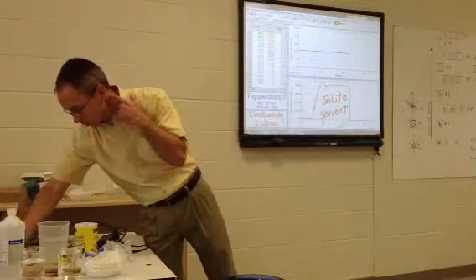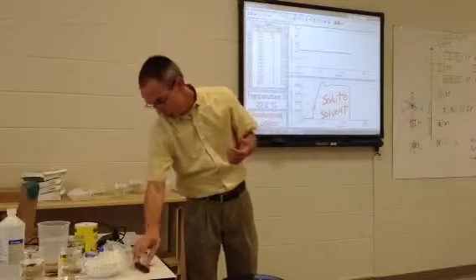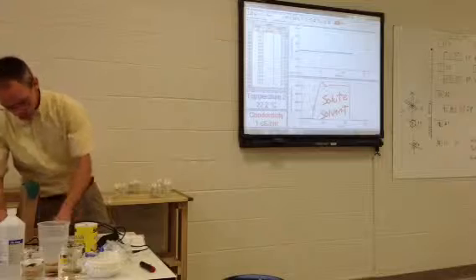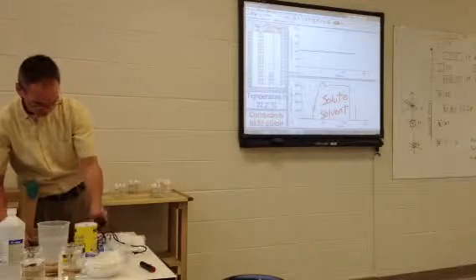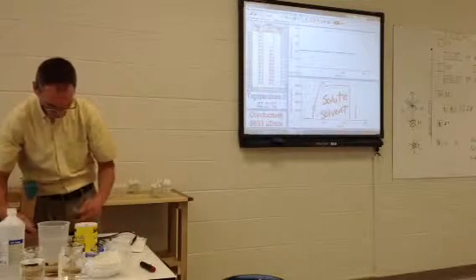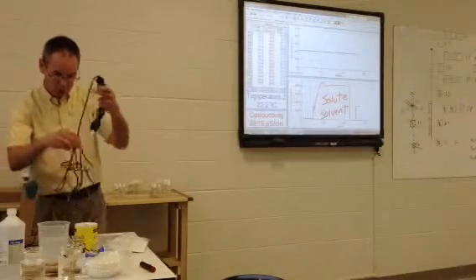So that's a good illustration of the polarity of water. I've got another one I want to show you. This one is an illustration of hydrogen bonding. So let me change probes again here. Two different probes out at one time here.